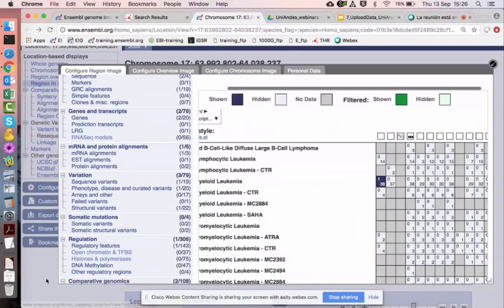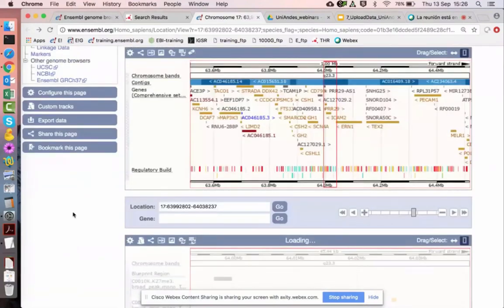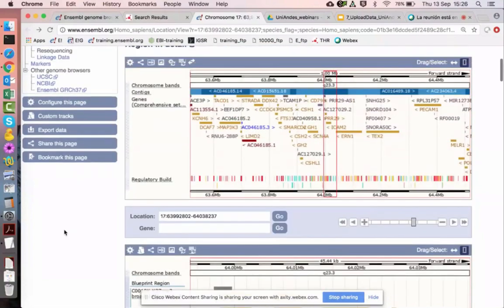And yeah, if you close that, this is how you then can customize what exactly you want to see from these 5,500 tracks. Okay. Yeah, mentioning 5,500 tracks. Again, it's important if you use track hubs to delete them again if you don't need them anymore, and also carefully think about if you need them in the first instance, because the browser will become very slow.